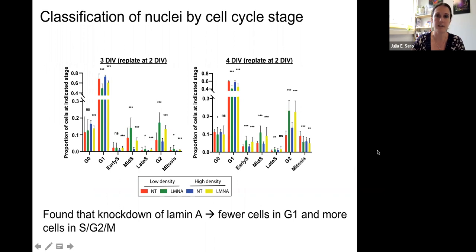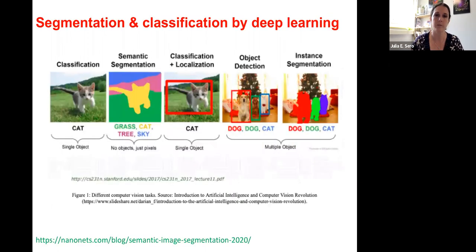So that's just a nice little proof of concept, but we've actually got 1, 2, 3, 4, 5, 6, 7, and we could even push that, I think, to 8. I think we'd have another mitotic class. So just using 3 stains, now we've got 8 different classes of cells that we can compare between conditions.